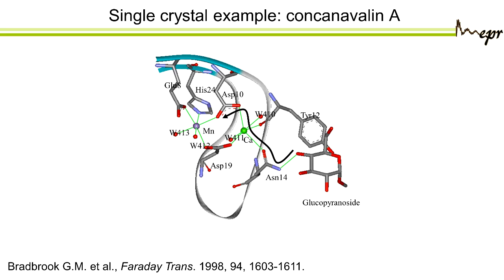Now, a crystal structure usually cannot give you the positions of the proton, and the idea here was, can we do proton crystallography? Can we do by ENDOR determine the positions of these protons of the water, or of the position of the proton of the histidines? If you know the structure of the imidazole, you know already where they are, but in water you don't know. So this was the idea of this work, and it was done on a single crystal.